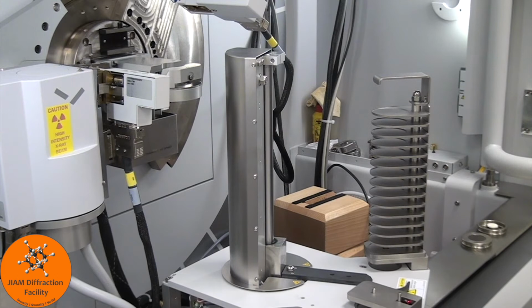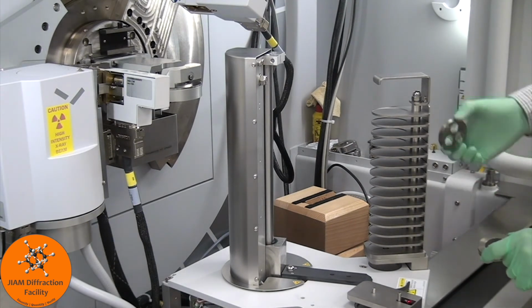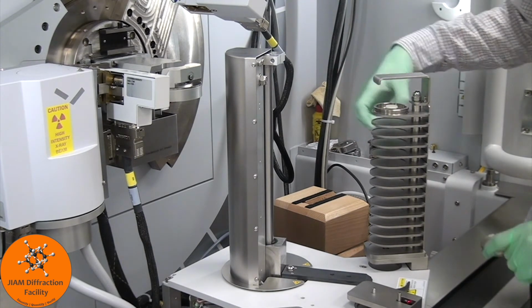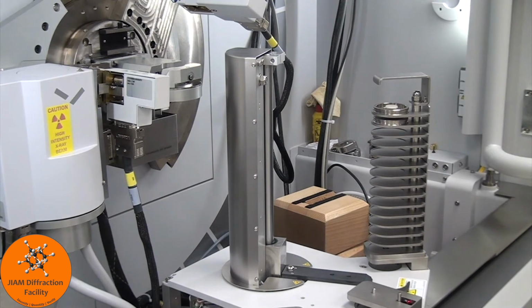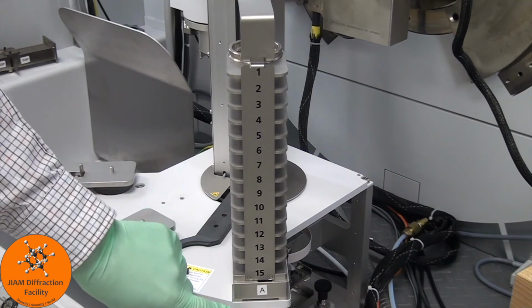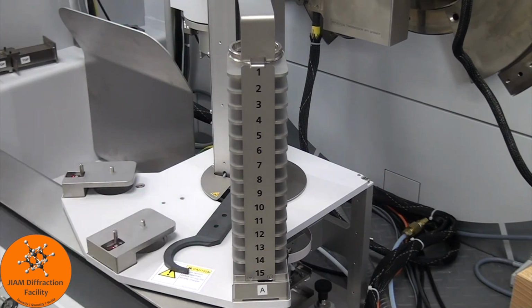You will go ahead and prepare your samples in the sample holders like you normally would. I have two examples here. You then just place them in these slots here. I will put this one on top, and then I'll slide this one in the next position, and that's it for loading your samples. Here you can see that this is magazine A, and there are positions 1 through 15, so we can hold 15 different samples.